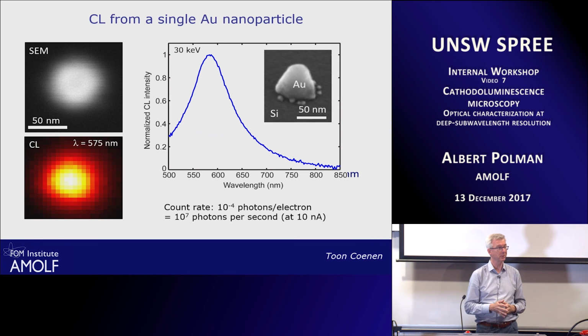You are. I don't have the spectrum here, but indeed, if you just take a silicon wafer, over the visible spectrum, it's completely flat. If you take a gallium arsenide wafer, then of course you get the band edge luminescence plus this transition radiation, so I get a completely flat spectrum plus the band edge. So you could generate UV and anything up to the photon energy. Of course, in the end, then you have to deal with this small efficiency here. You can think about lithography. If you want to do XUV lithography, you want to make XUV light. This is a way to do it, but it turns out for that application, the intensity is quite small.